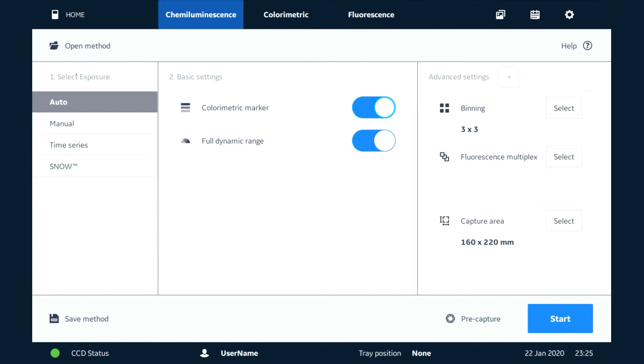We go into the mode here and we have four different exposure modes. The first one is auto, so when we use this we can avoid saturating our image.